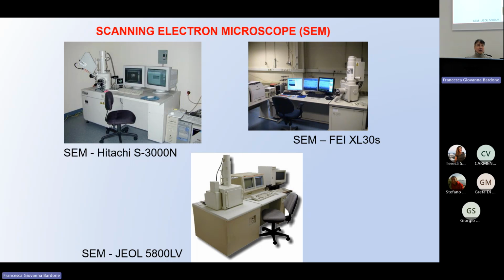If the specimen cannot sustain vacuum, you can use what's called specimen preparation to fix, to block your specimen, so it does not change if you evacuate the chamber. So there are a huge number of techniques which allow you to fix your material, your biological material, but you change the material.